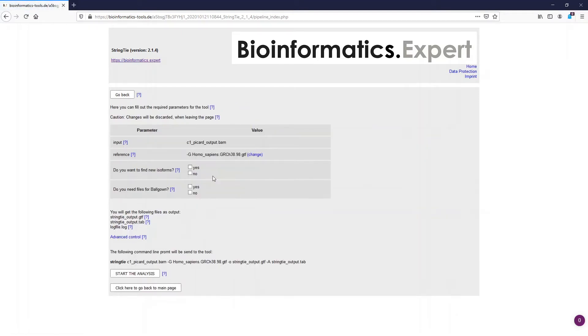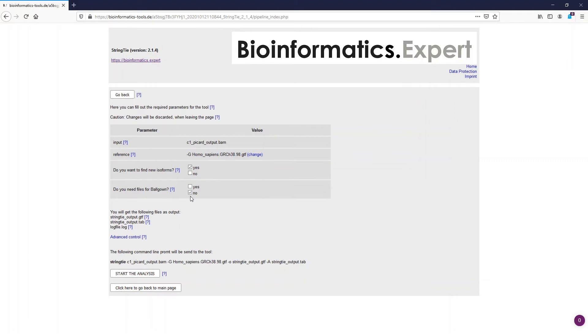However, make sure that you use the same reference which was used for the alignment. The question if you want to find new isoforms we answer with yes. However, files for Ballgown we don't need right now. We will need them later. So now we answer this question with no. Now we are ready to start the analysis.